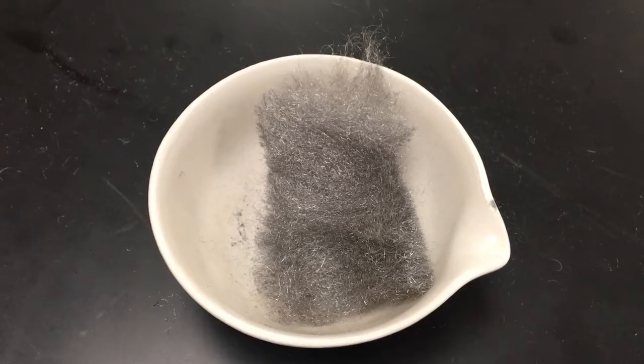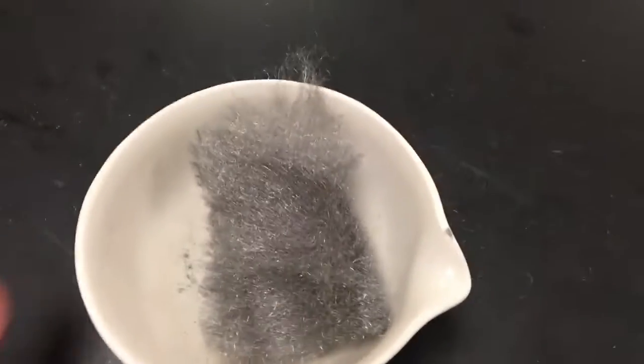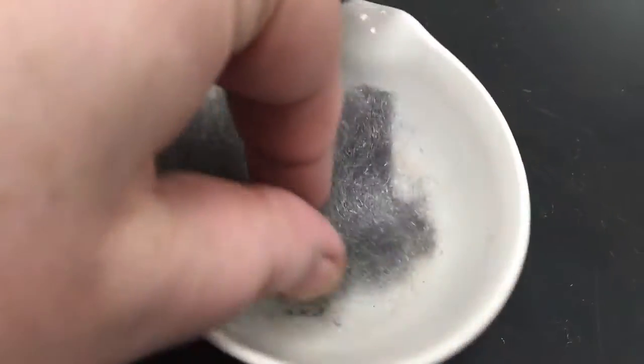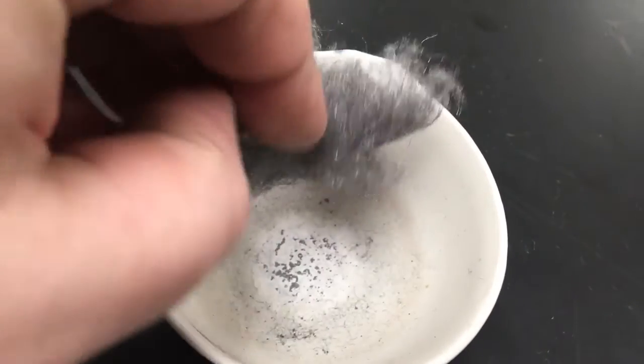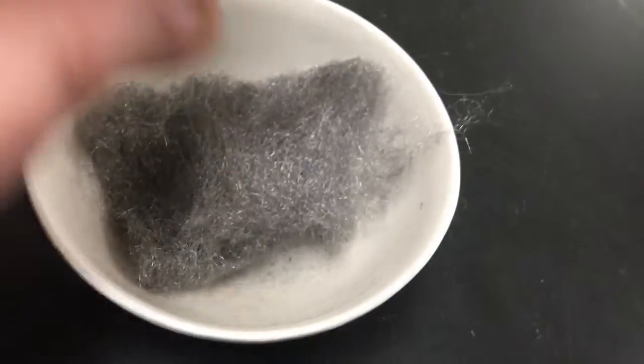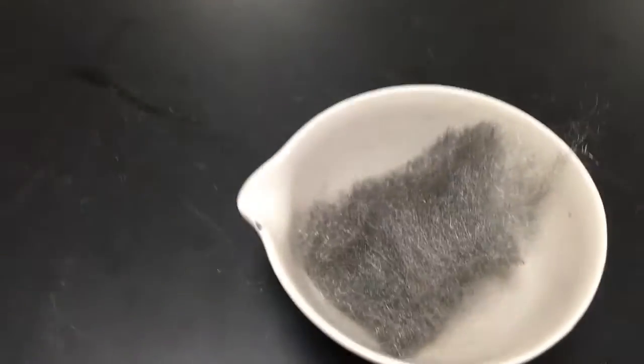So here's our piece of steel wool already in our evaporating dish. I'm giving you a little bit of an angle on it to be able to see. I have already fluffed this up a little bit, so I've separated some of these fibers, just making sure they've got some space between them, some air between them.